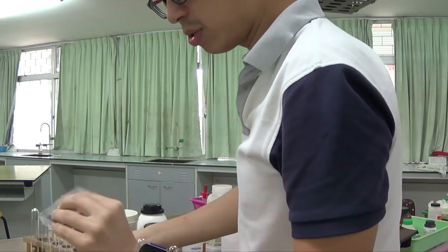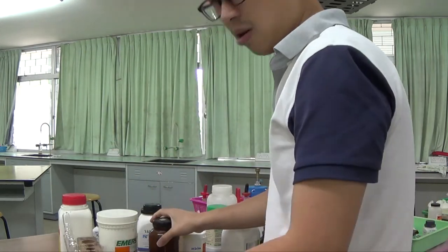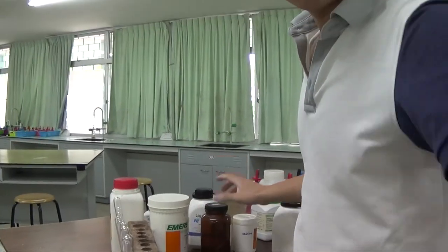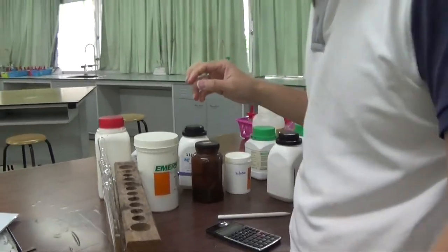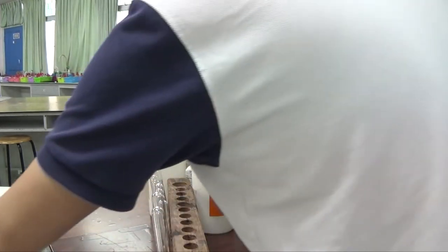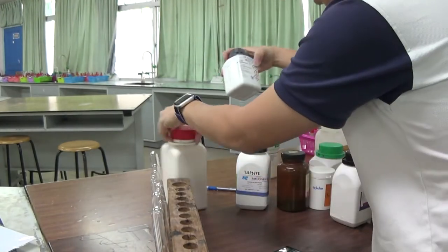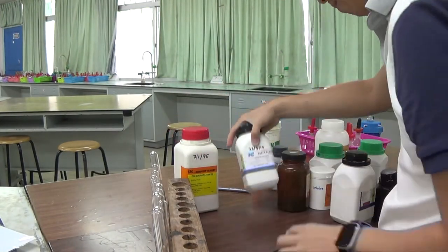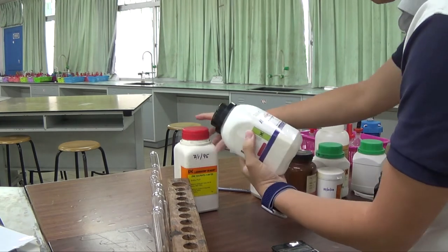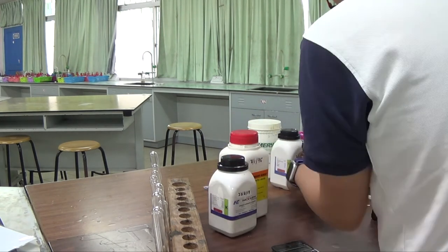So this thing is not that useful anymore because they've all gone bad. Okay, you don't want to focus on seeing my face. Let me actually stop that first. Let me start with the white compounds, which are hydrated sodium carbonate, hydrated zinc sulfate, and one more.